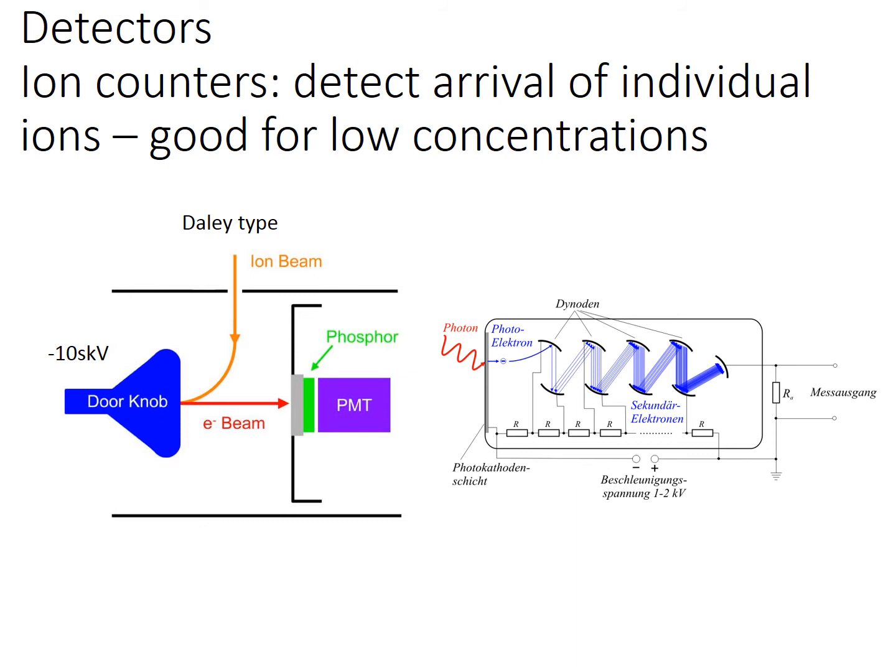Okay. So the advantage of these kind of detectors is that they're really good because they can detect the arrival of an individual ion, so they can measure really, really low levels, really small ion currents. But they do have a bunch of problems with them. In fact, when, for instance, this cascade is going on, if another ion arrived, it wouldn't notice. Okay, so when you have lots of ions arriving, their efficiency goes down. Okay, so you need to calibrate for that when you're making your measurements.